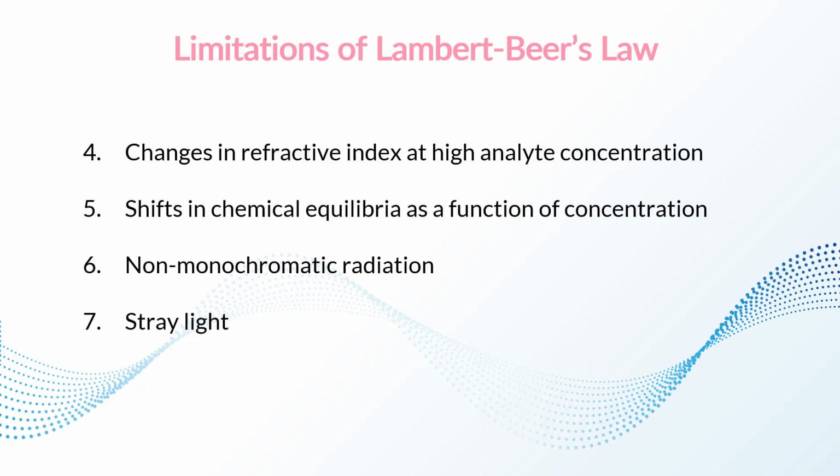And stray light, if your things are not properly closed, and some light from some other part is coming to this sample, then it's going to affect the entire process of absorption. So there are many things that are going to affect Lambert-Beer law.